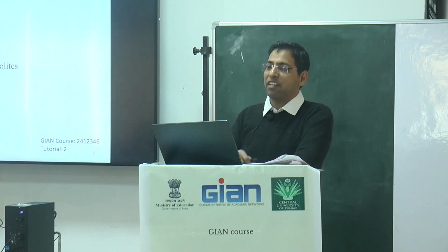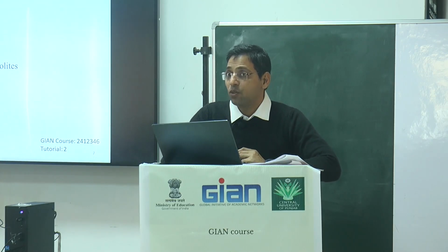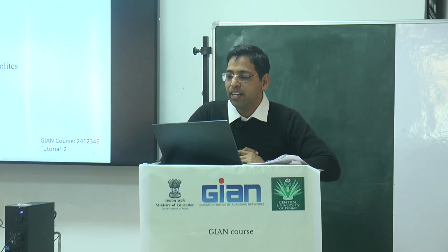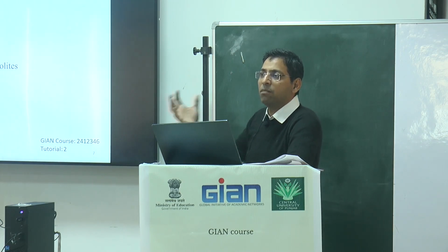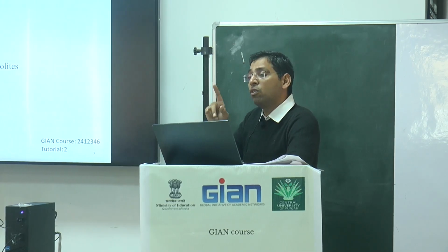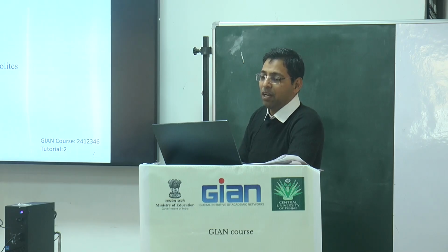So now I am coming to the targeted metabolomic investigations. Here, these are the 5 different pipelines in a stepwise manner we are using. The first one is the raw data acquisition, so how you actually retrieve the raw data for your further analysis. Then generation of the referential databases. You have to generate some databases using some particular software. Third one is the isolation and identification of the metabolites from those databases, whatever you constructed here. Then you have to normalize and quantify only those analytes on which you want to focus. And finally is the biochemical interpretation.